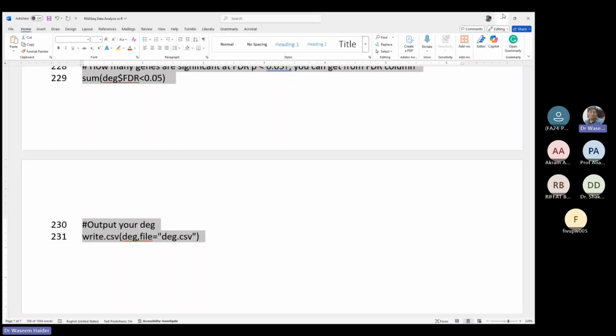This is R, and let me make its graphics a little bit bigger. So what I can do is GUI, and 16 is, I think, okay. So that one is good, visible, right? Now next, I can write the code here.